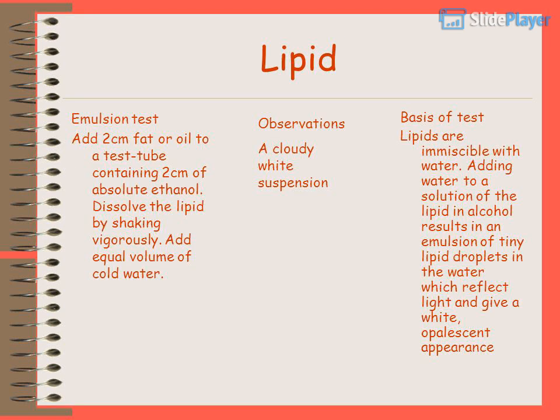Lipid. Emulsion test. Add 2 cm³ fat or oil to a test tube containing 2 cm³ of absolute ethanol. Dissolve the lipid by shaking vigorously. Add an equal volume of cold water. Basis of test: lipids are immiscible with water.